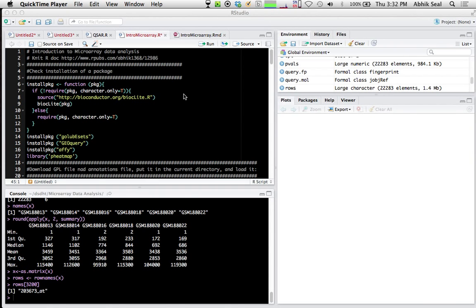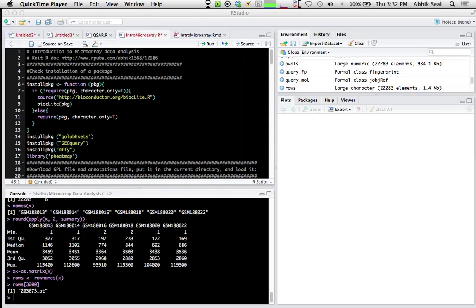Welcome to this module of introduction to microarray data analysis. This exercise will show you how to do differential gene expression analysis on dioxin-induced gene expression.